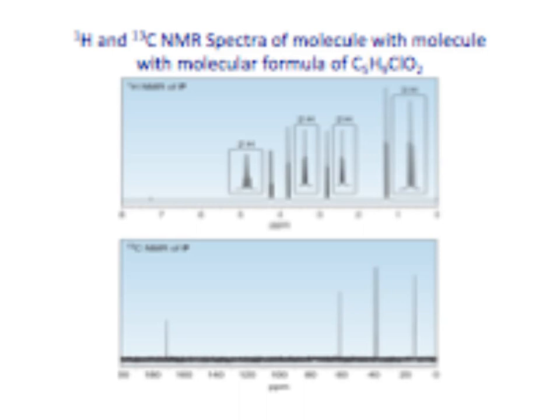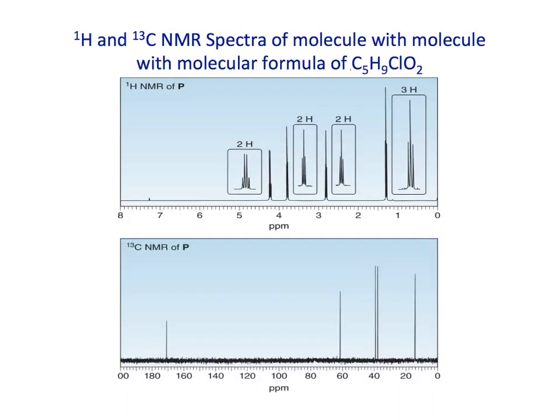Yeah. Okay, so let's look at this one. We have proton NMR and we have C13 NMR, and we have a formula up on top. Okay, so there's our molecular formula. So let's start out by figuring the number of unsaturations. How many unsaturations do we have? Just one.